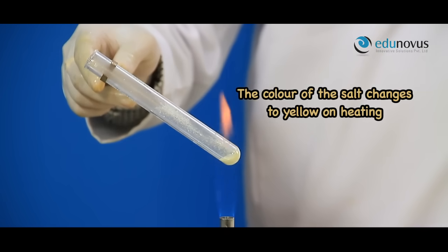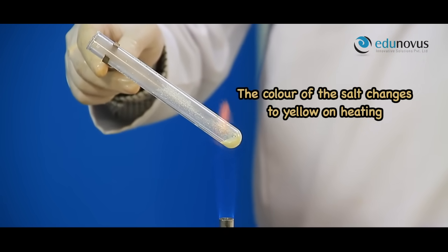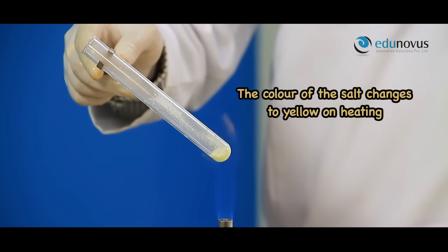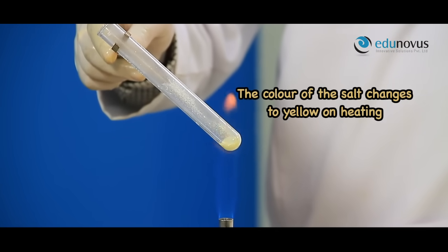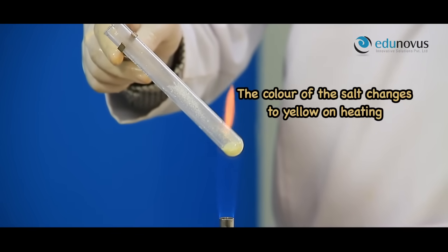Here you can see the change in color of the salt to pale yellow. In this way, if the salt is yellow when hot and white when cold, it infers that the given salt may contain zinc cation.